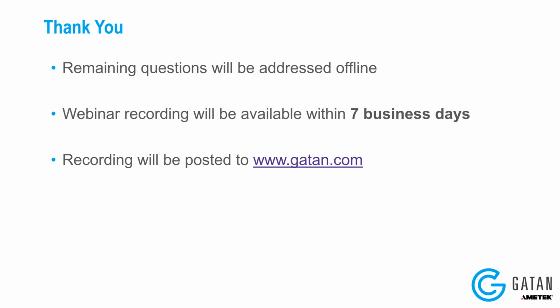Or if you're trying to look at short range order, a lot of times people want to look at the diffraction patterns from the data that they acquire and then do some kind of analysis of the diffraction pattern to get at that short range order. In either case, what I'm trying to get to is that having a camera that's good for 4D STEM, with high dynamic range and good signal to noise, will benefit all of those applications.